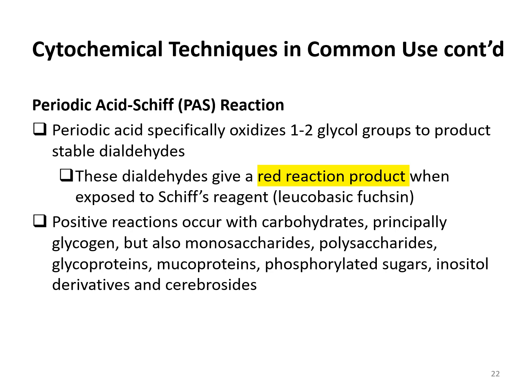It is possible to detect this as long as carbohydrates are present, like monosaccharides, polysaccharides, glycoproteins, mucoproteins, sugars, phosphorylated sugars, inositols, and cerebrosides.